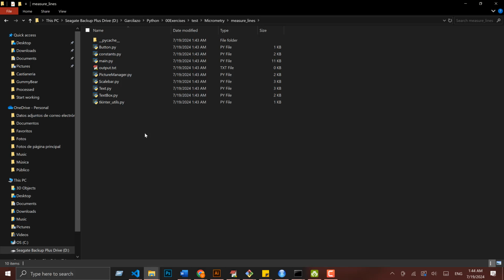No frills at all. It is just a program that shows you a camera and allows you to access a scale bar and then a line. Nothing else. So if you are only working with straight lines to take measurements of segments, for example, or the diameter of eyes in spiders, perhaps this is the only thing you need. So I suggest you to just use the simplest tool.